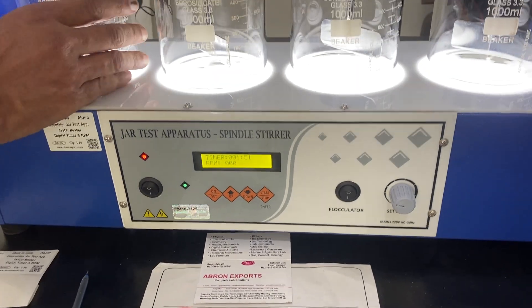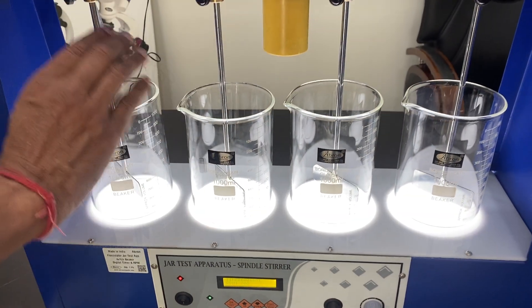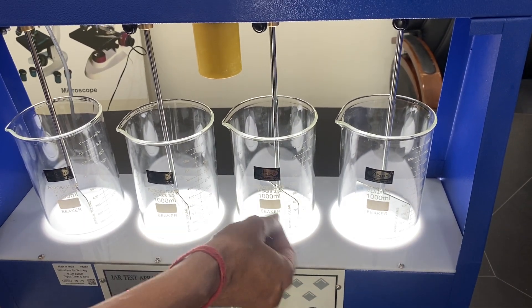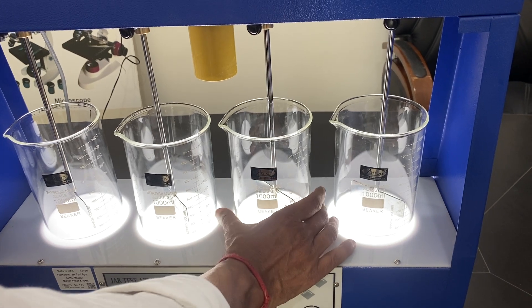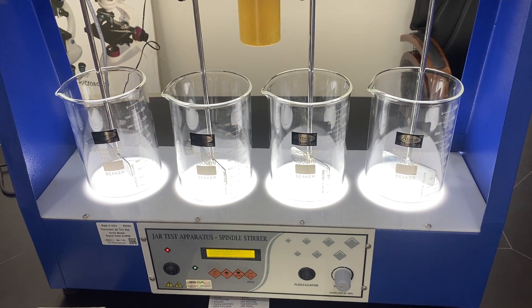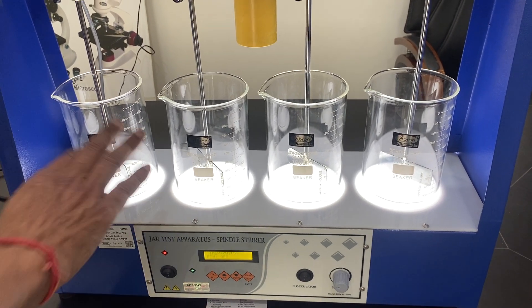These are the 4 beakers where we put the chemical inside, filling up to this level, and then observe the turbidity or flocculation — to see the effect of water from a river or pond, and other chemicals can be added.